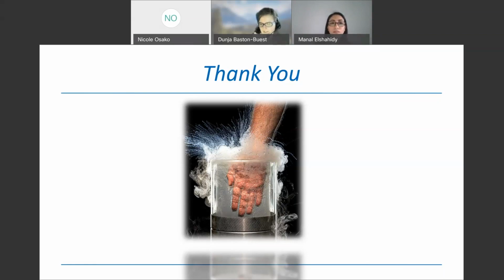We have a daily visual observation of the tanks because we work 7 days a week. What we also do, we have probes for the temperature and for the filling level. And we also support this by manual measurement. That's our way of doing it. And at the moment, we've got about 10 tanks to observe every day.